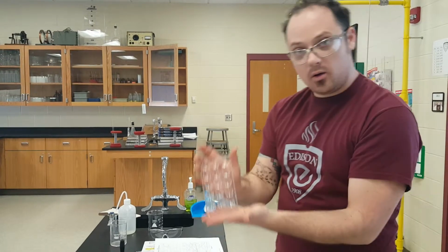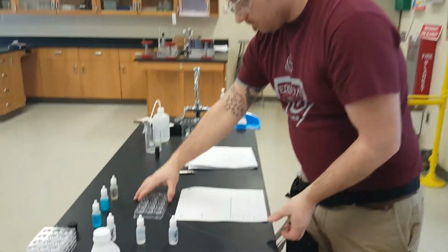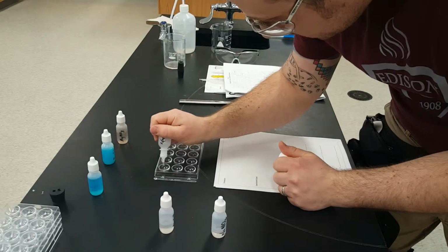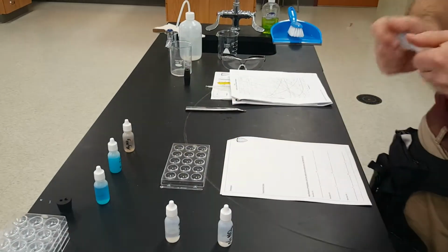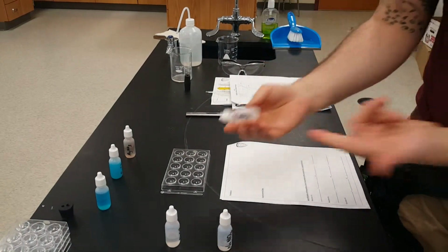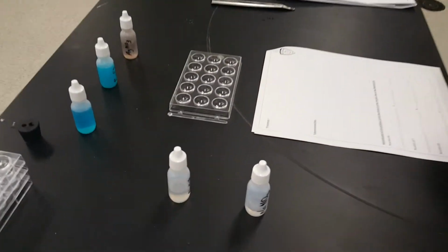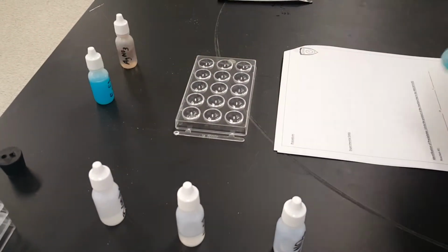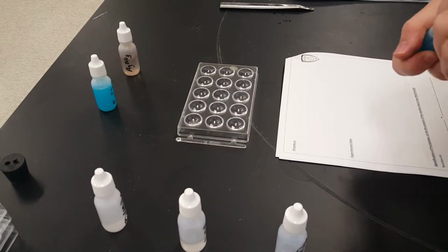So your procedure is taking a microwell plate, taking 5 drops of each chemical. 1, 2, 3, 4, 5. Nothing happened. Looks like clear liquid. It's aqueous. It's dissolved. And I'm going to mix it with 5 drops of its combination, and I'm going to see what happens.